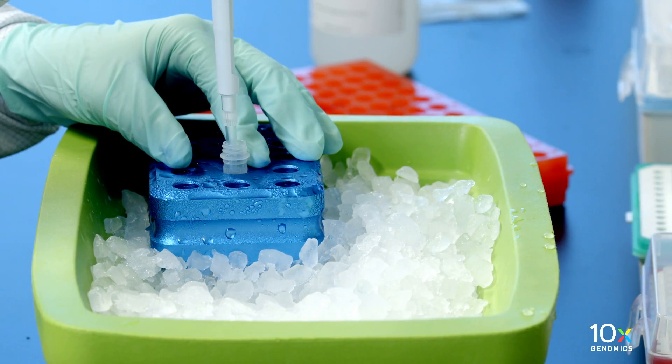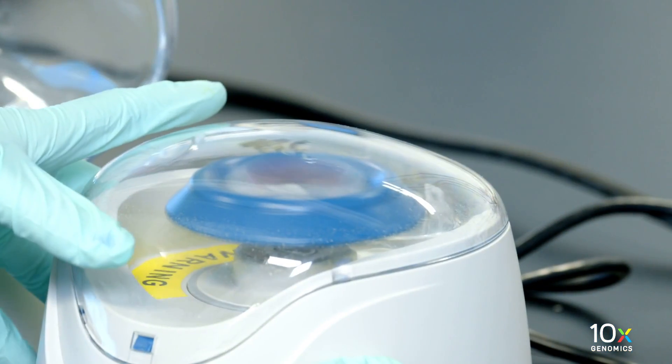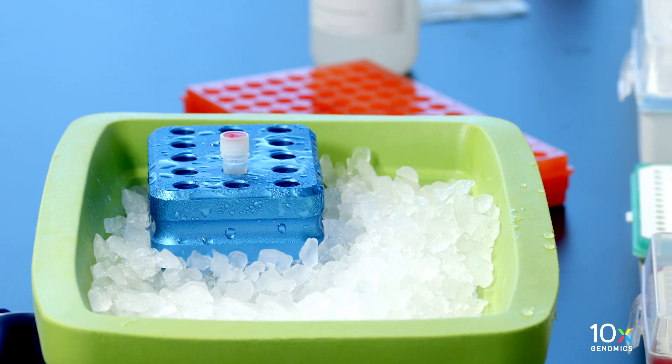Pipette mix the RNase enzyme. Centrifuge briefly and maintain on ice until ready to use.